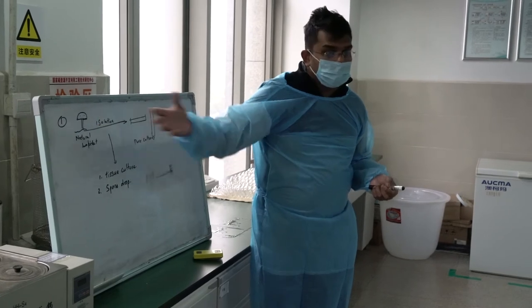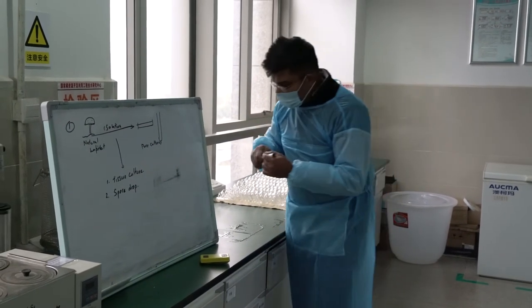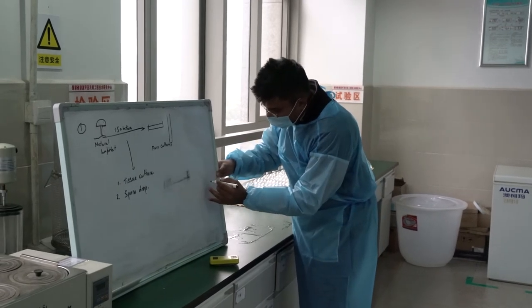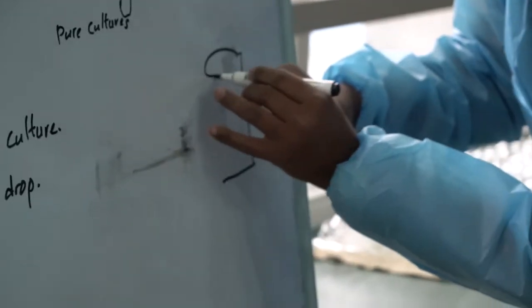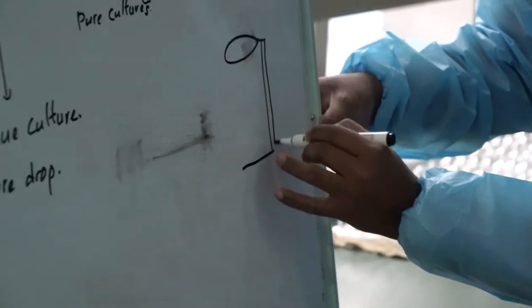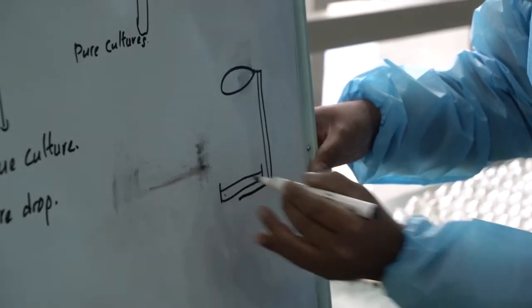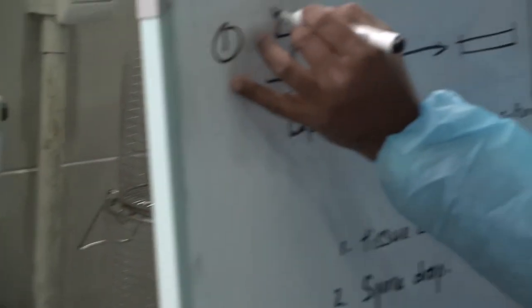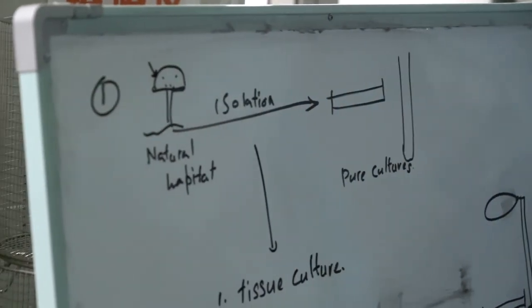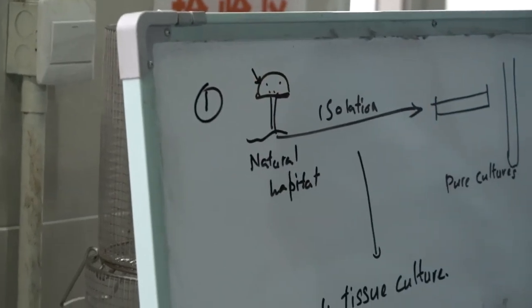If you have a mushroom with a cap, inside the laminar flow, I will make a small stand and keep the petri plate here. This is the part of the mushroom that has spores underneath. I cut this cap and keep it here.